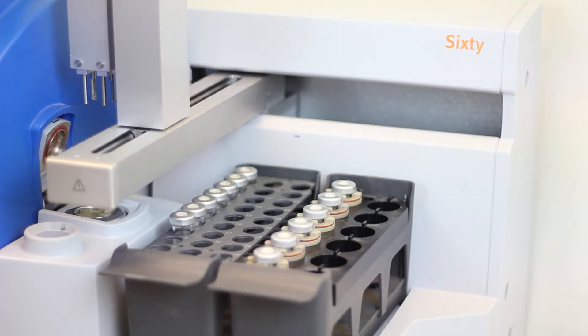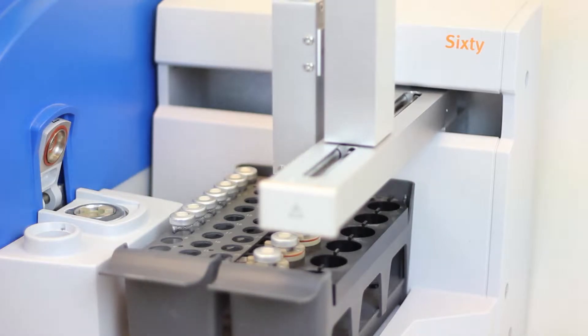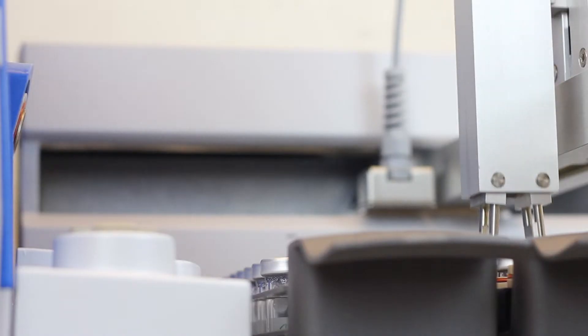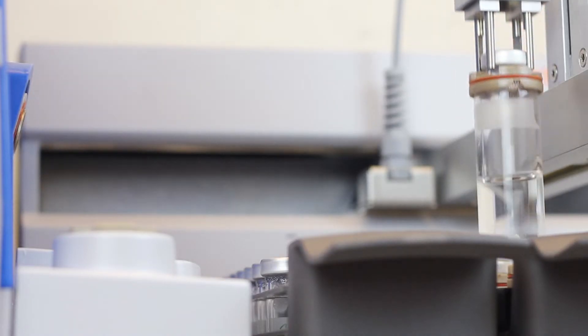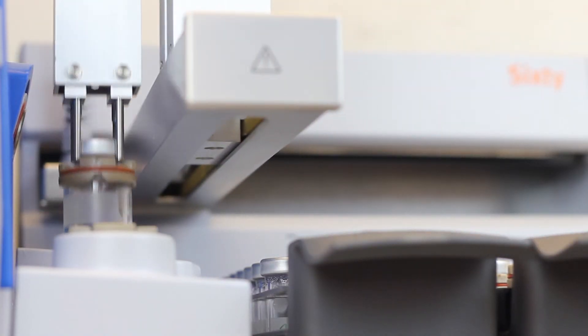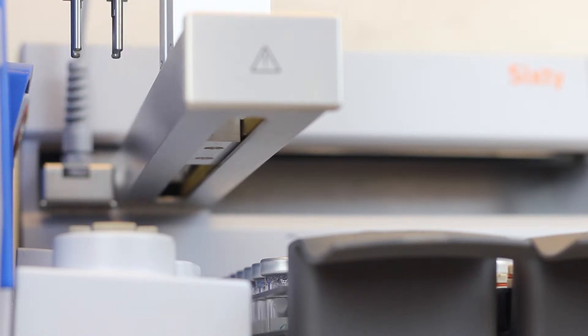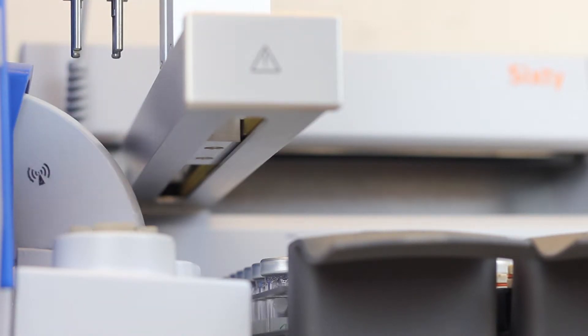With the automation you can rack up 8 or 60 reactions in one go which means you can do a large amount of reactions in a completely automated fashion. You can set things up to leave them overnight or unattended and it enables you to be very productive.